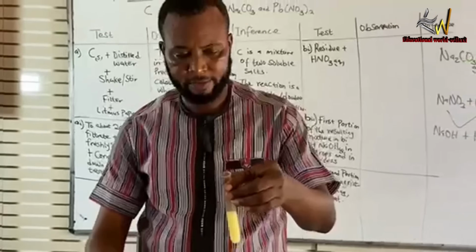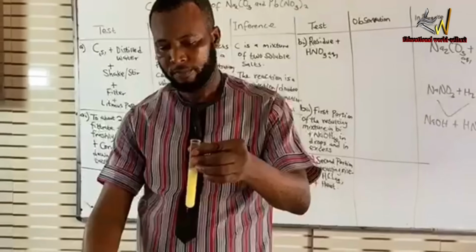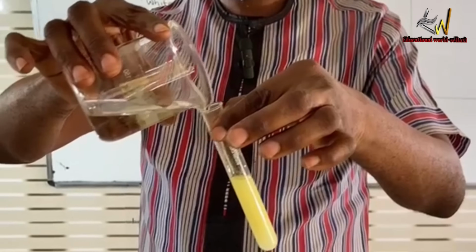It's not giving me my results. You see the brown ring at the junction of the two aqueous layers.